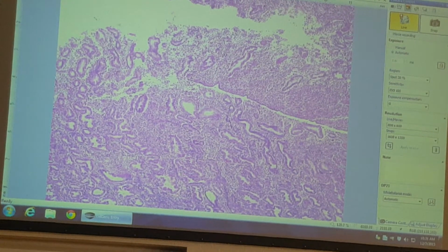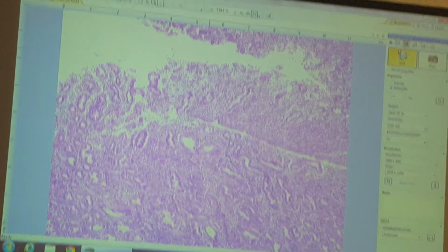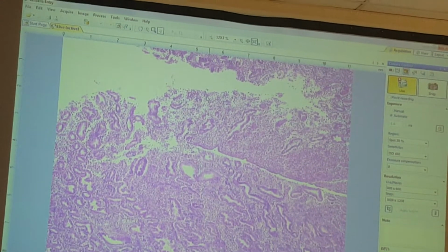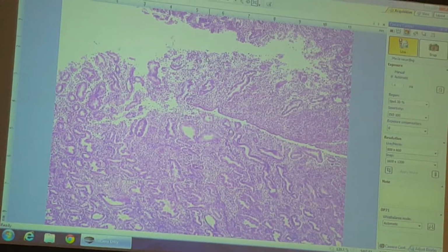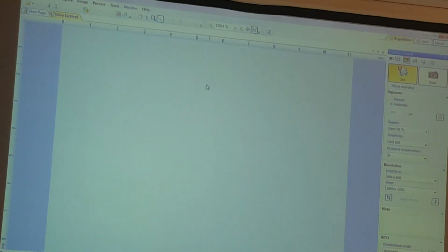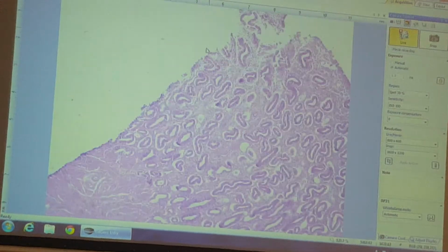What is this tissue out here called? Lamina propria. Pretty good? Lamina propria is only in the endometrium, correct? Because endometrium is simple columnar epithelium plus lamina propria. Perfect. So that was the menstrual phase, days 1 through 5 in a typical cycle. After that, the glands have all been ripped off of the stratum functionalis, which was shed off.